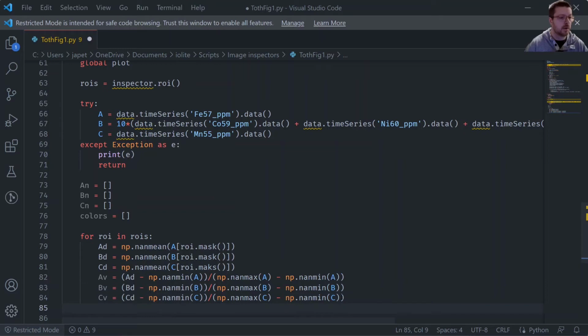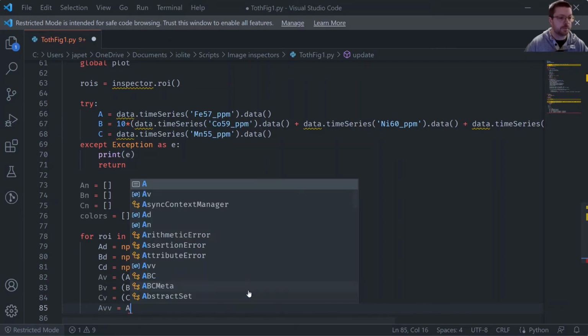Okay, and now we're going to do something like this to make it so that they all sum up to 1.